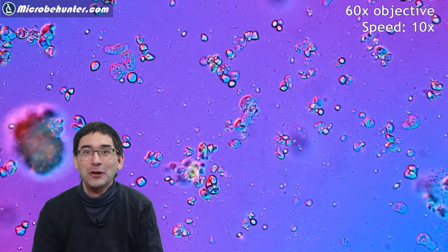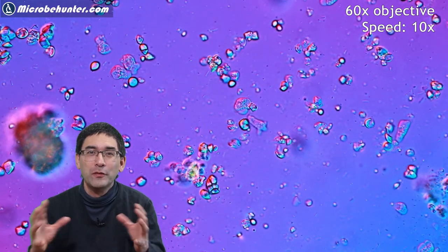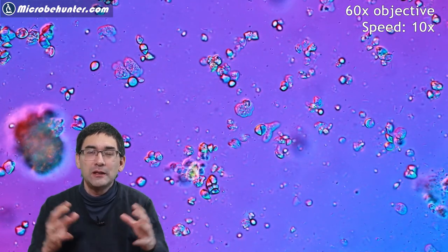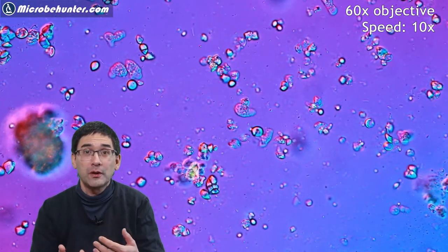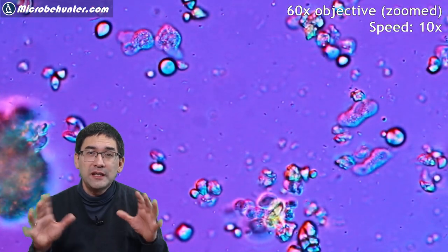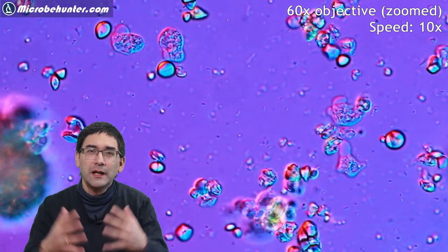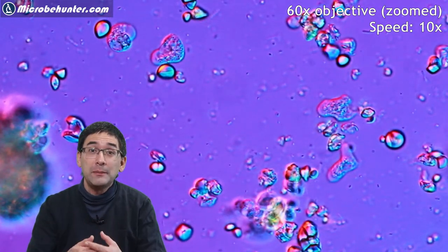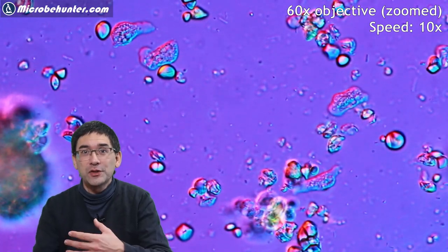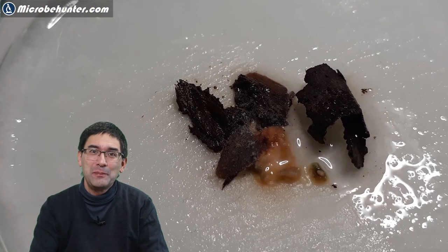And this is basically what I saw. If you look very carefully, you can see several of these amoeba moving around scavenging the food. All of those other clumps that you see here are mostly food particles, starch primarily from the wheat grain. And in between, you can see in the background those little darker dots moving around. These are bacteria and those bacteria are also a food source for the amoeba because sometimes those bacteria feed on the starch.